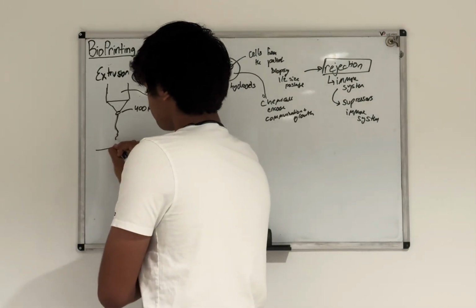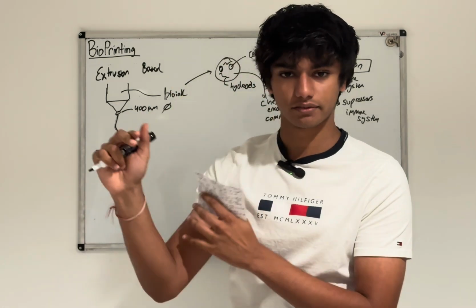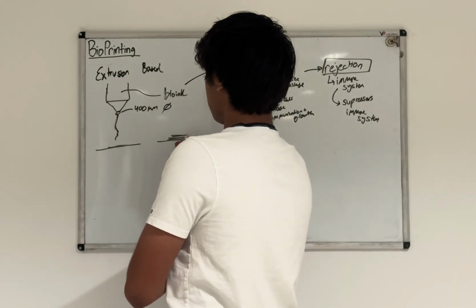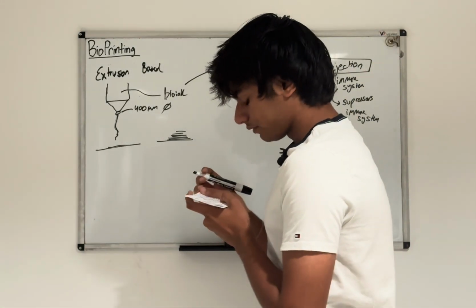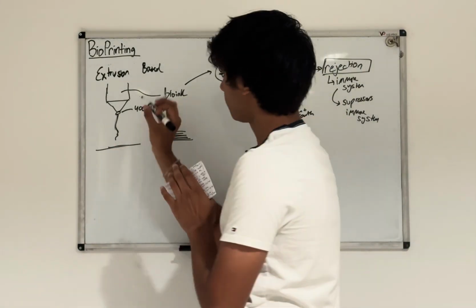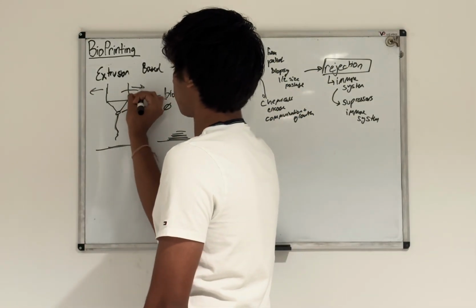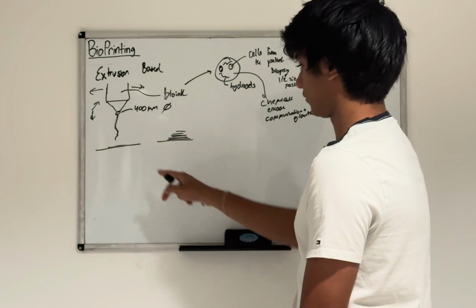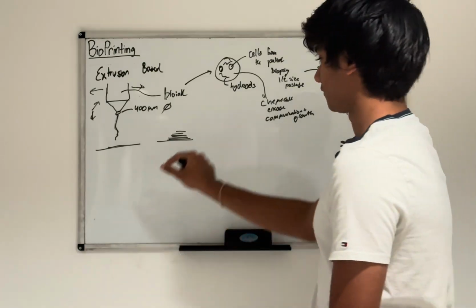Okay, and this bioink can then accumulate in layers. Like 3D printing, if you've ever seen a 3D printer that has layers, you can have one layer here, one layer here, and you keep adding layers, and you can create tissue and organs. And oh yeah, one more thing. It's also very similar to how a 3D printer works. This moves in the X, Y, and Z direction. So it can go up, down, left, right, and this allows it to move the nozzle and be able to print the right material in the right place.